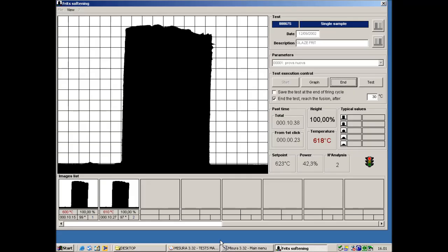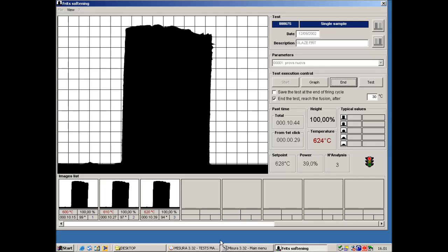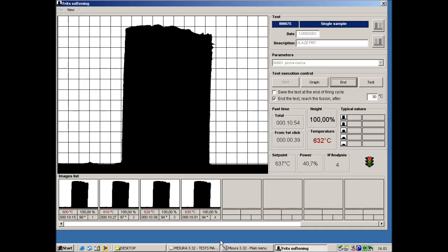This is an example of analysis of the softening of a ceramic frit. The heating rate is 50 degrees per minute. The image acquisition starts from the temperature set by the user and in this case it is 600 degrees centigrade. The size and the shape of the specimen are automatically analyzed.